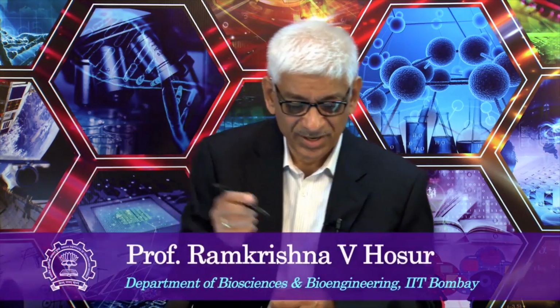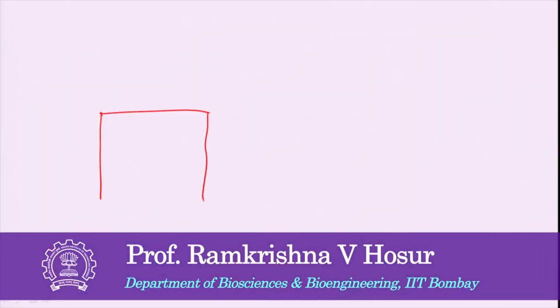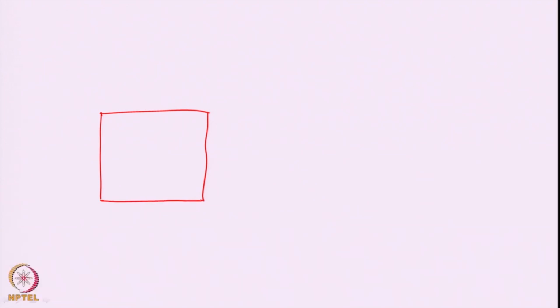In the last class we discussed the details of the two-dimensional COSY experiment, and we will just have a recap of that here. So, the two-dimensional COSY experiment looks like this. For a 2-spin system, you will have a so-called diagonal peak for each of the spins, and this will appear with plus signs for all the components.